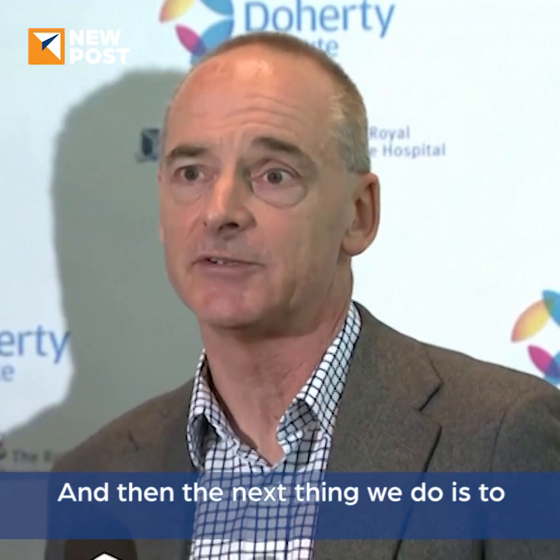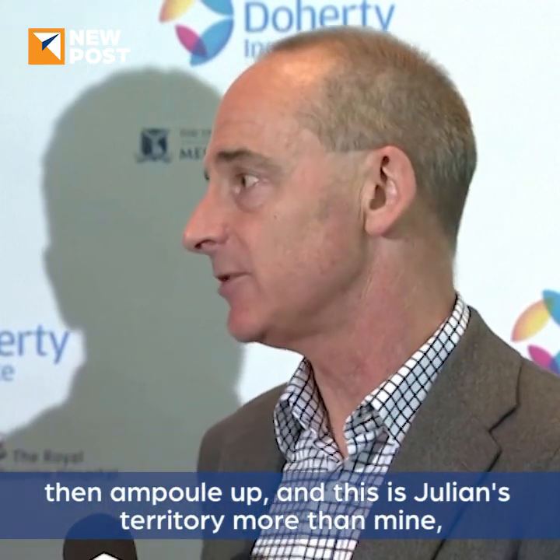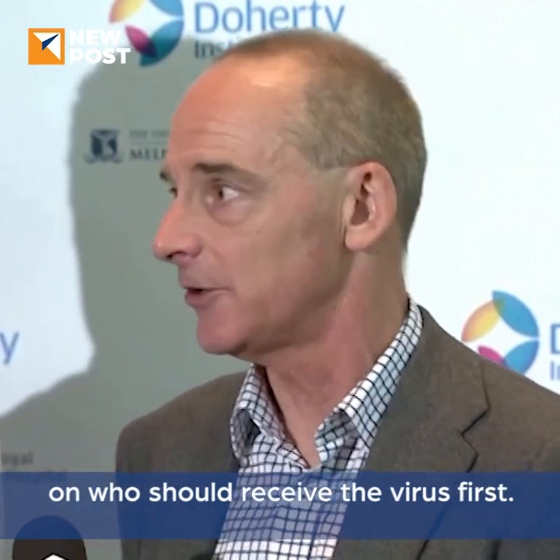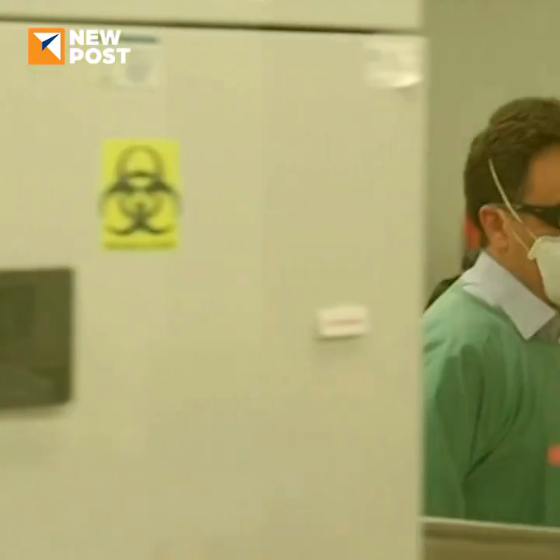And then the next thing we do is to ampoule up, and this is Julian's territory more than mine, ampoule up the virus itself for sharing with expert laboratories that are recommended to us by the World Health Organization as the first internationally with which the virus could be shared. So we'll work closely with WHO and take their advice on who should receive the virus first.